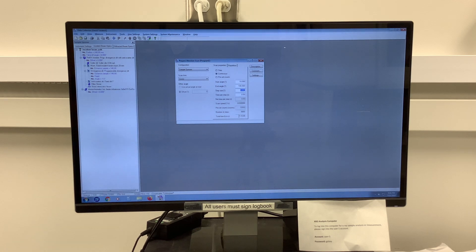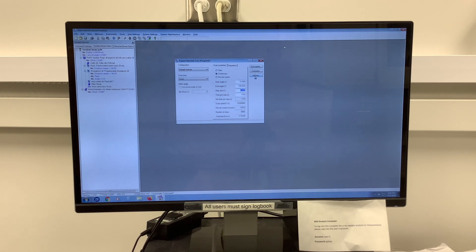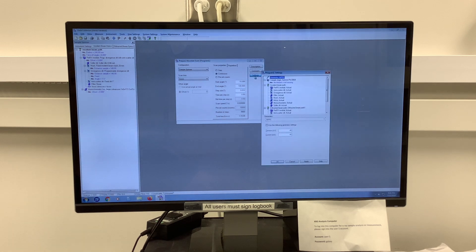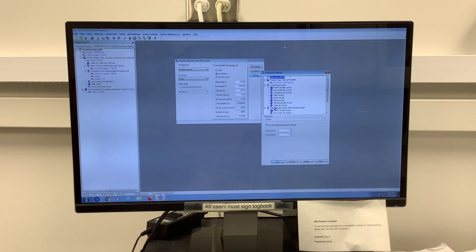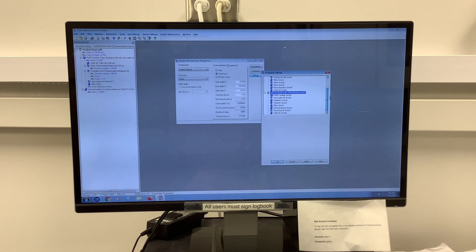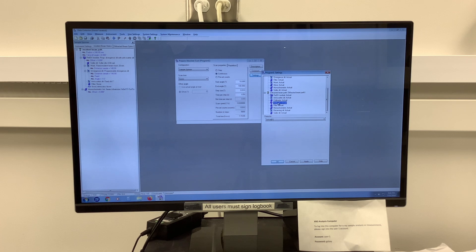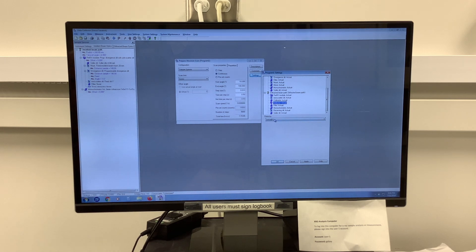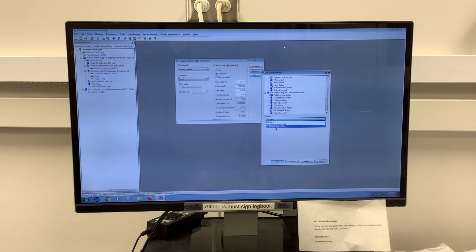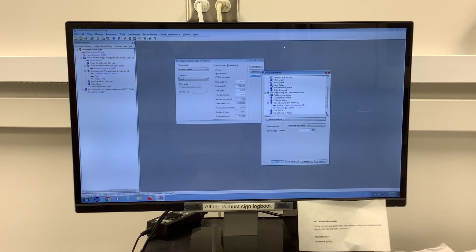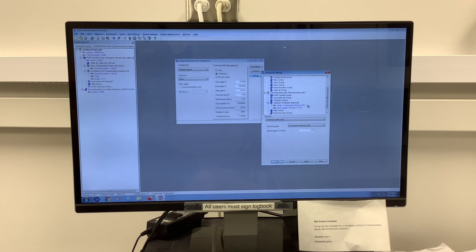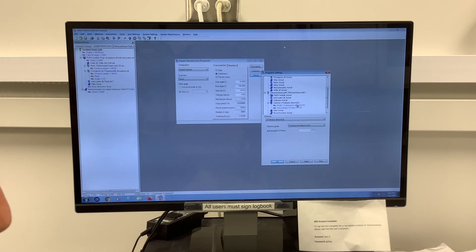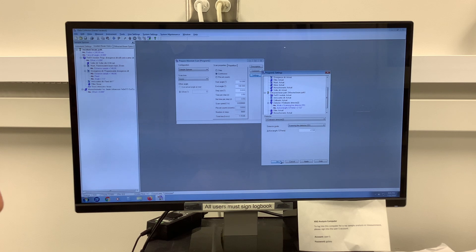To choose the detector, I'm going to go to settings on the right hand side, and I will scroll down to the diffracted beam path. And under the diffracted beam path, I see detector actual. Here, I'll change actual to my X'Celerator detector number two. It will automatically select scanning line detector, the active length. There's no need to change any of these parameters, and I will say OK.